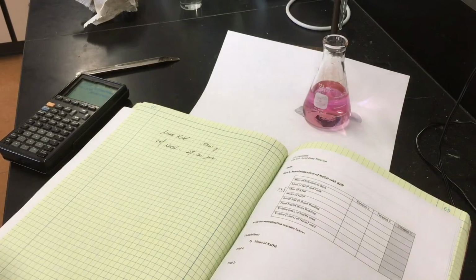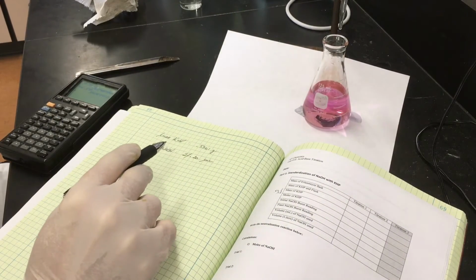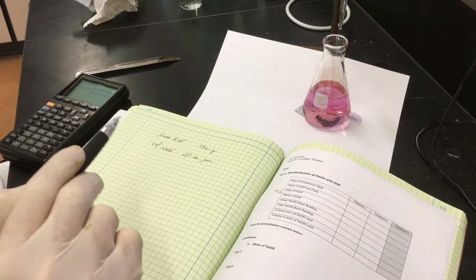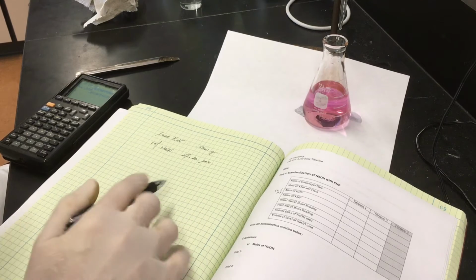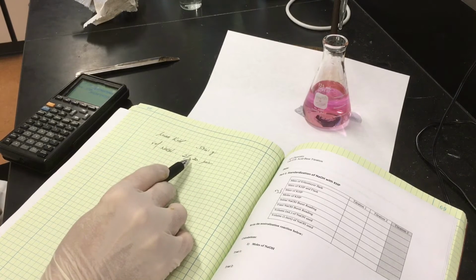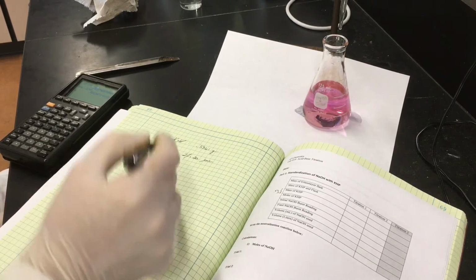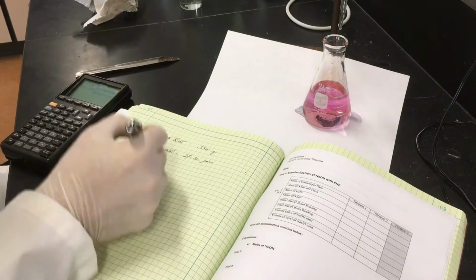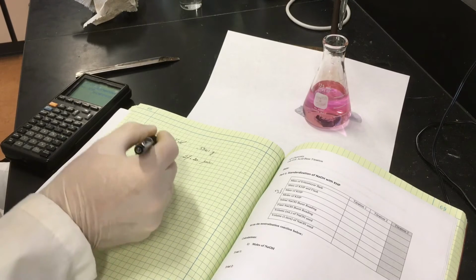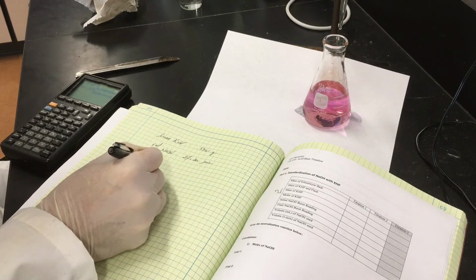Now we have to read the volume of NaOH that we used to get to the endpoint. So now that we have the volume of NaOH used, we can calculate the exact concentration of the NaOH, because we know that at 27.20 milliliters of base, we are where the moles of acid are equal to the moles of base. So we can calculate the moles of acid from the mass of KHP, because the mass divided by the molar mass is going to give us the number of moles.